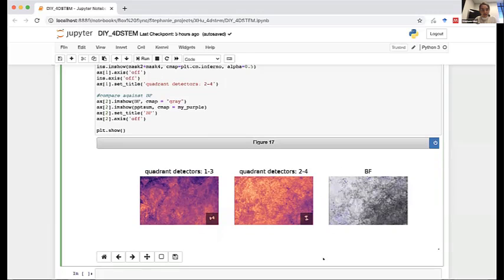So that's all I had to share. I hope that I've convinced you that coding in Python is fun and easily accessible and very useful for analyzing your specimens. And I guess we'll see if there are more questions now.